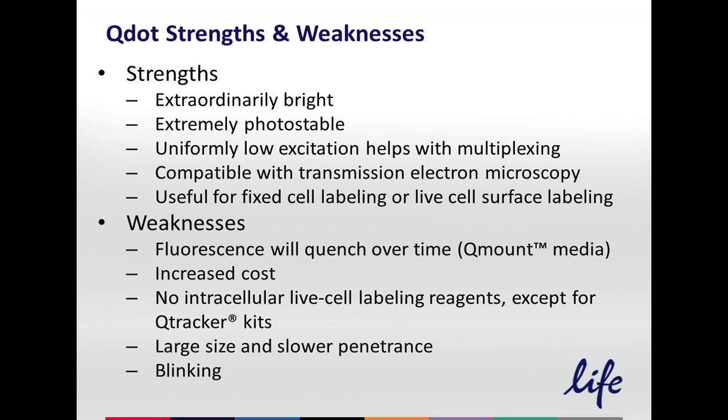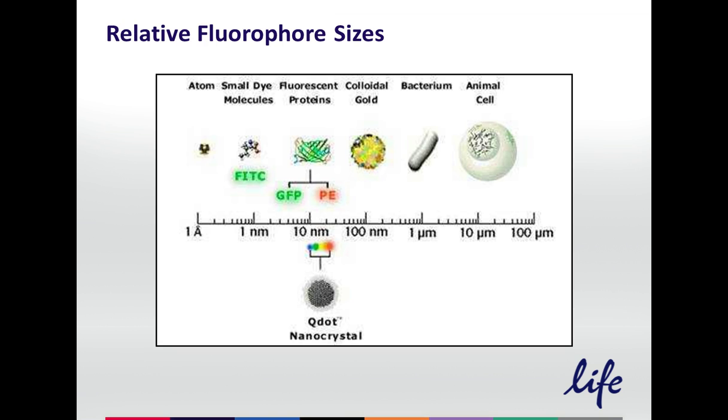And then the blinking that I mentioned earlier can be a little bit distracting. Again, it doesn't usually affect your assay. Okay, so those are the four different classes of fluorophores that I wanted to discuss. Here you can see their relative sizes.